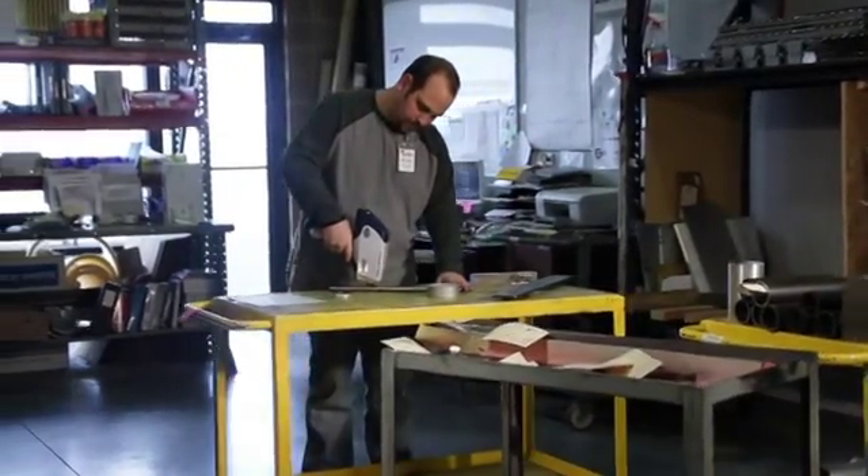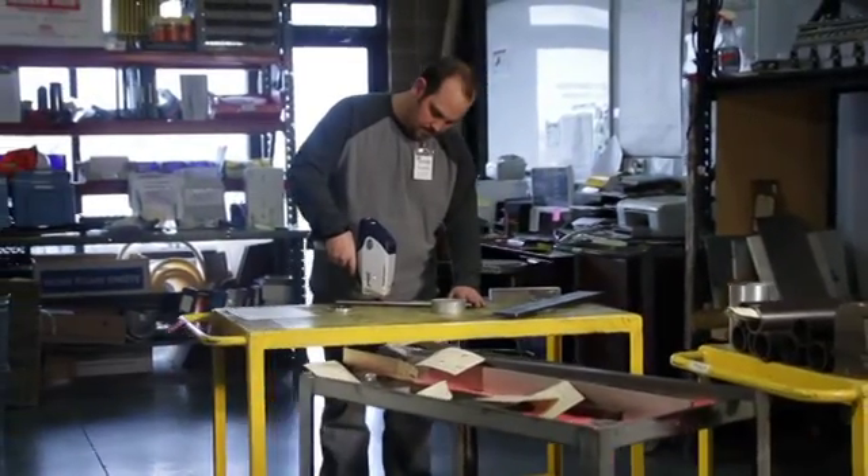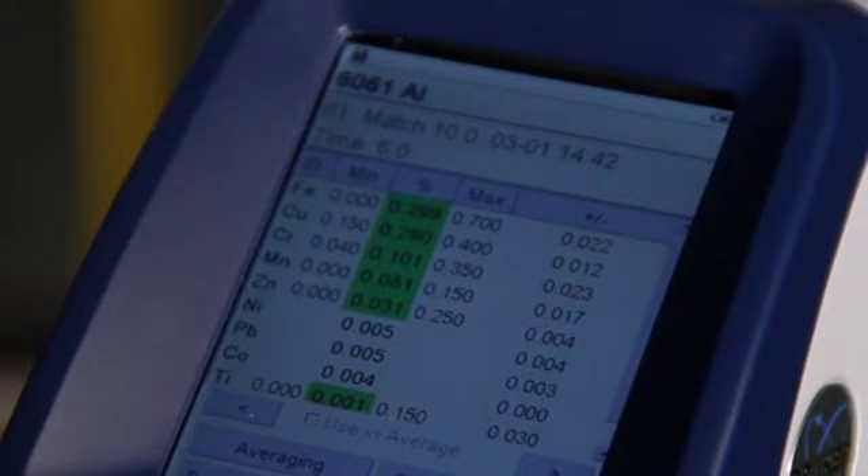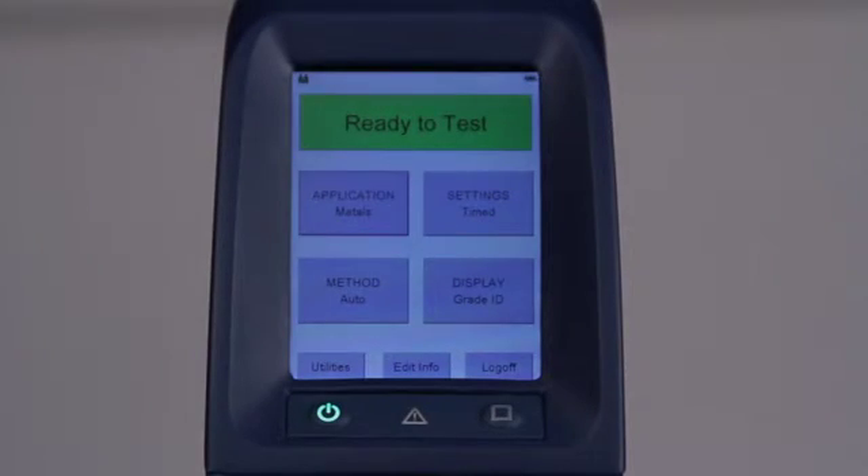When the trigger is pulled, X-rays are activated, and this should quickly result in the display of a set of data on the screen. The main menu allows the selection of application, method, settings, and display settings. See the user guide for description of these various controls.